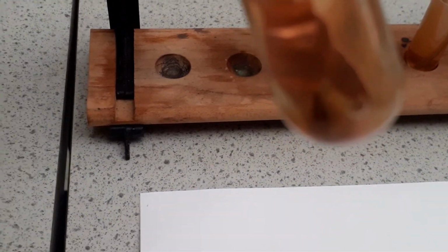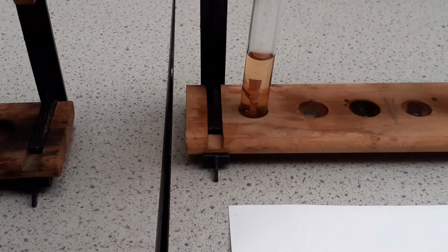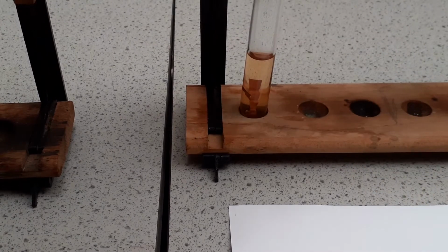Now if we look at the iron, there's no change at all to the copper. So nothing happens. We look at the zinc. There's a bit of bubbling, slightly grayer because we've got some iron, so there's a reaction occurring there.